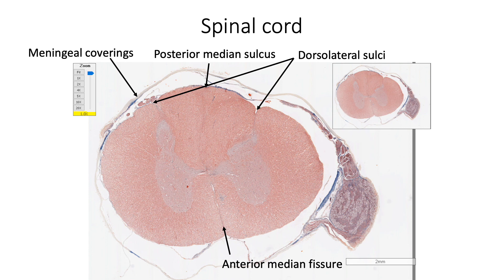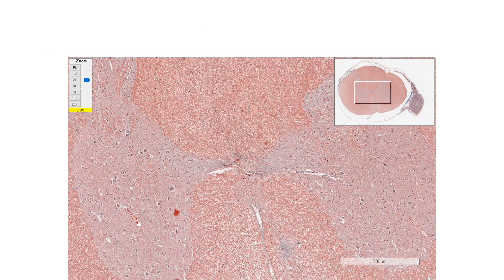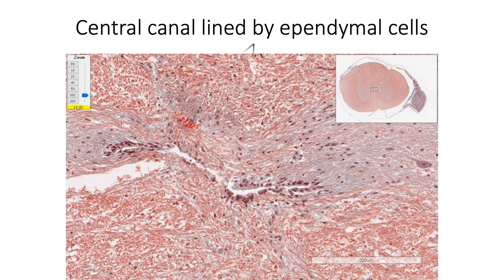Spinal cord has a butterfly-shaped central grey matter surrounded by peripheral white matter. The right and left halves of the grey matter are connected by grey commissure traversed by the central canal. The central canal is lined by ependymal cells, appearing as columnar ciliated epithelium or pseudostratified columnar ciliated epithelium.